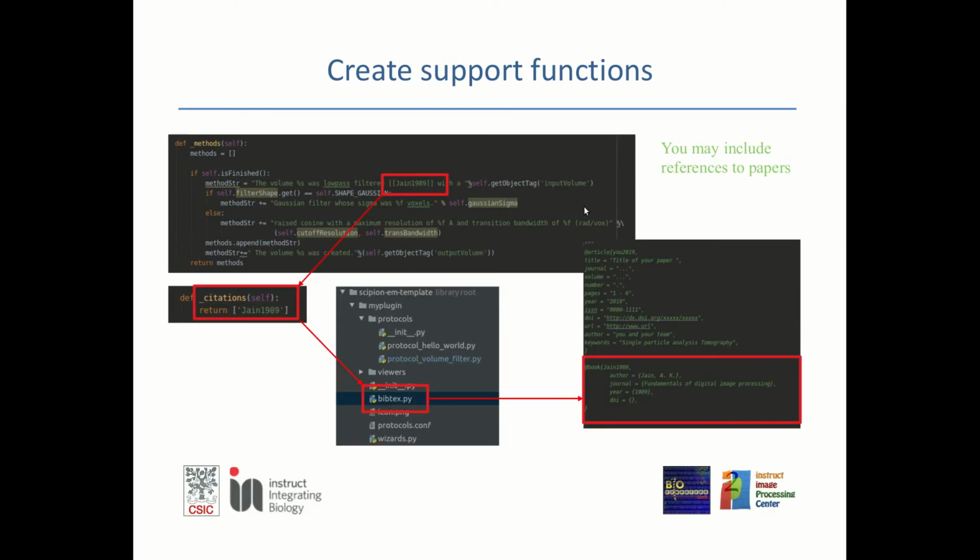The thing that is new is making references. For the references, you need this syntax in the string, so double brackets, and then for these double brackets, in your function you need another support function that is in your protocol.